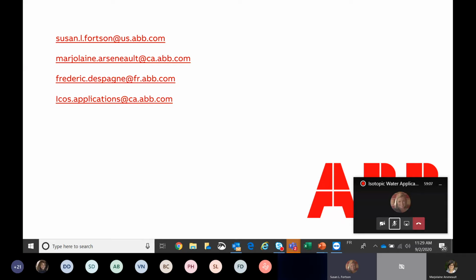Also, you can try removing the transfer line as well, cap the septum port, and do an injection without water. You can also watch the trend and make sure it's not increasing.